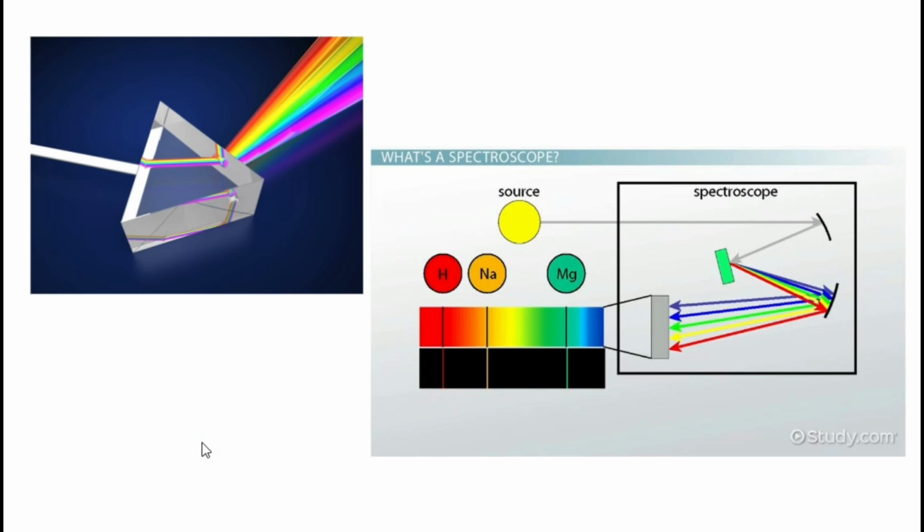To give you an illustration of what that means, for example, here is your direct light. Upon striking a substance known as a monochromator po, this will separate the different wavelengths of light, having these different colors po of the rainbow. And if we look at laboratory methods, it's more on the analytes po, which have their own unique wavelengths po that we will measure them with.